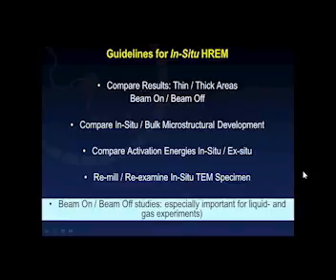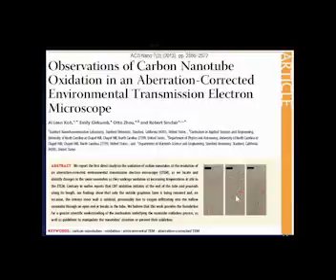I had mentioned in the earlier part of my talk that the beam on, beam off studies are especially important for liquid and gas cell experiments. And I would like to elaborate on this through an example concerning oxidation of carbon nanotubes, which we performed a few years ago. The work was published in ACS Nano in the year 2013.